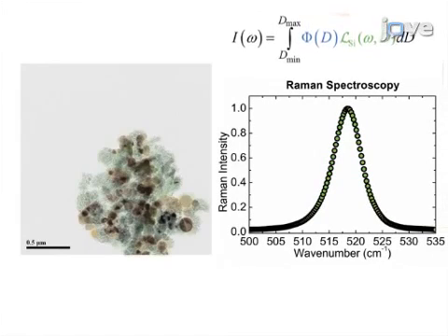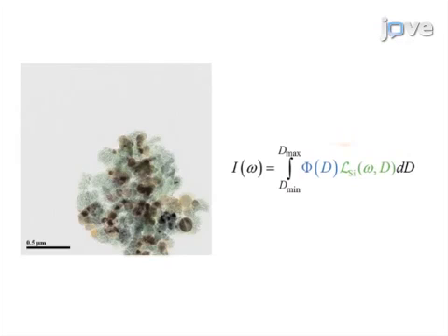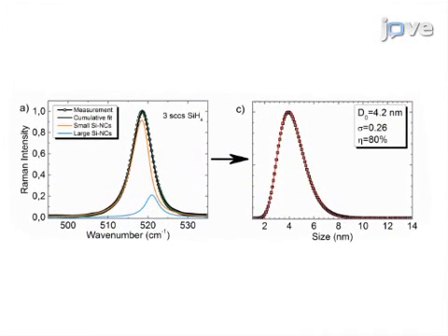The second step is to analyze the measurement data and locate the subdistributions in it using the multi-particle phonon confinement model. Next, the mean size and the width factor of the subdistributions from the fitted model are determined. The final step is to use the obtained parameters to determine the actual size distribution of nanoparticles of interest.